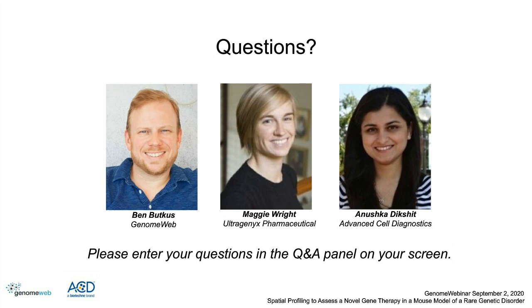The images that we saw here were taken on our Zeiss Axio imager, which has a motorized stage. This allows us to take large stitched images of entire brain regions or of entire brain sections. We've since acquired a scanning microscope, an Axio scanner also from Zeiss, that has the same ability, but at a little bit higher throughput scale to get those big, beautiful images that you're able to see right here. It's a really powerful approach to see that broad biodistribution.